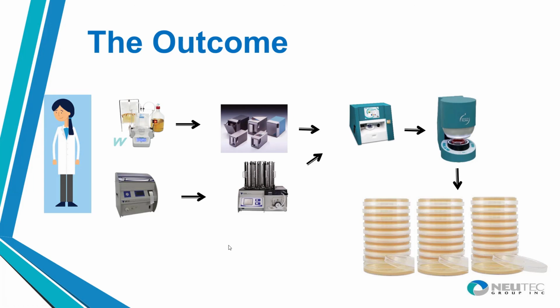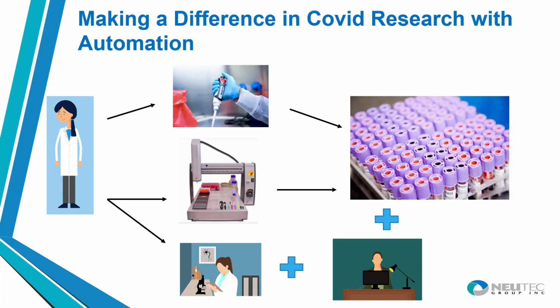Example here is that you have a certain workforce, and for these test kits and the testing that needs to be done, you often have to fill a very large number of test tubes. And so this workforce could spend all day with a pipetter and fill up these tubes, and they'll be able to get a certain amount done. But with an automation, this is called an XY tube filler or bottle filler. This system can be set up with any kind of approach to do lots of different sizes of tubes or bottles.